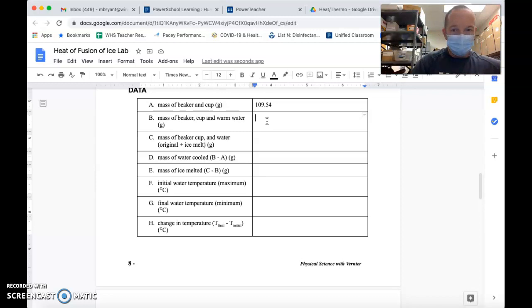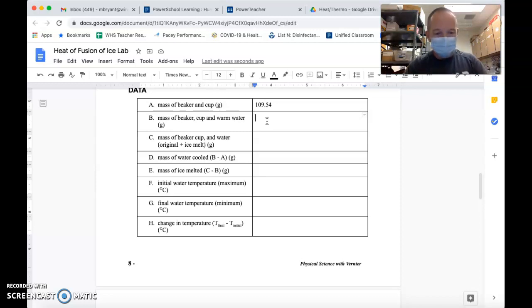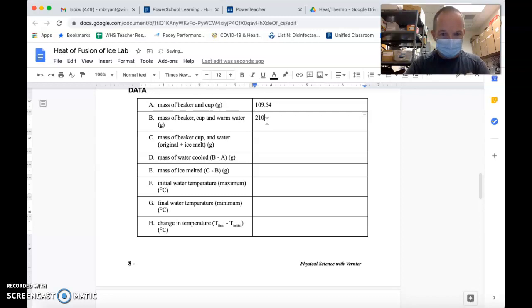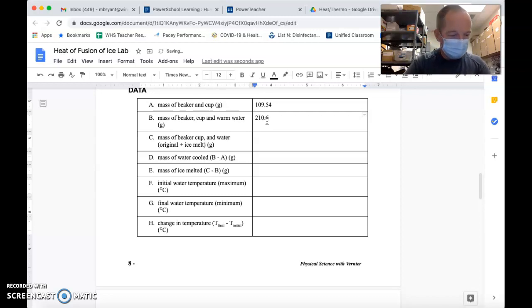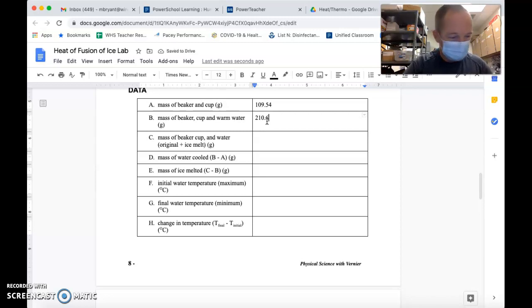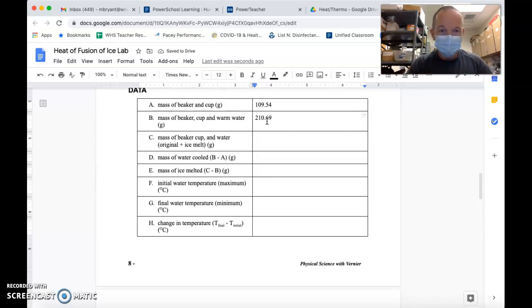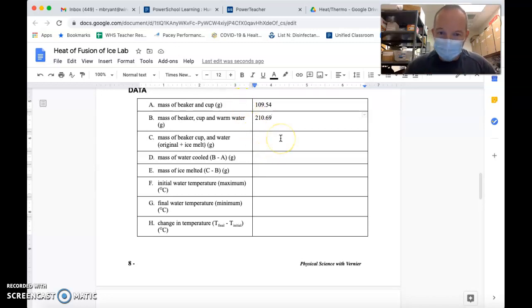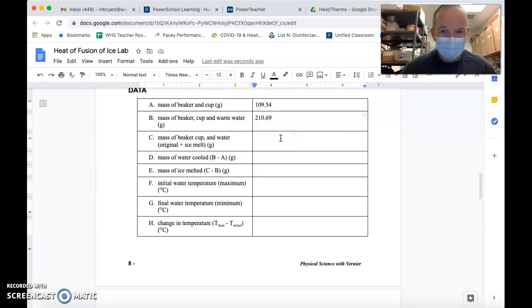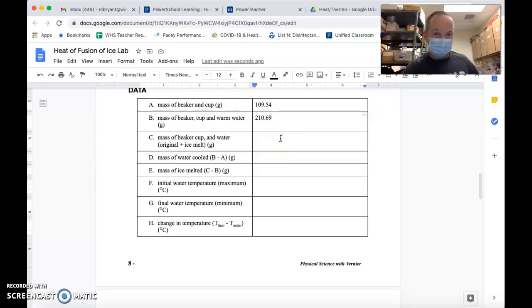Now I'm going to record the mass of that. It looks like I have slightly more than 100 milliliters, slightly more than 100 grams, but I'm going to fill in 210.69 grams.